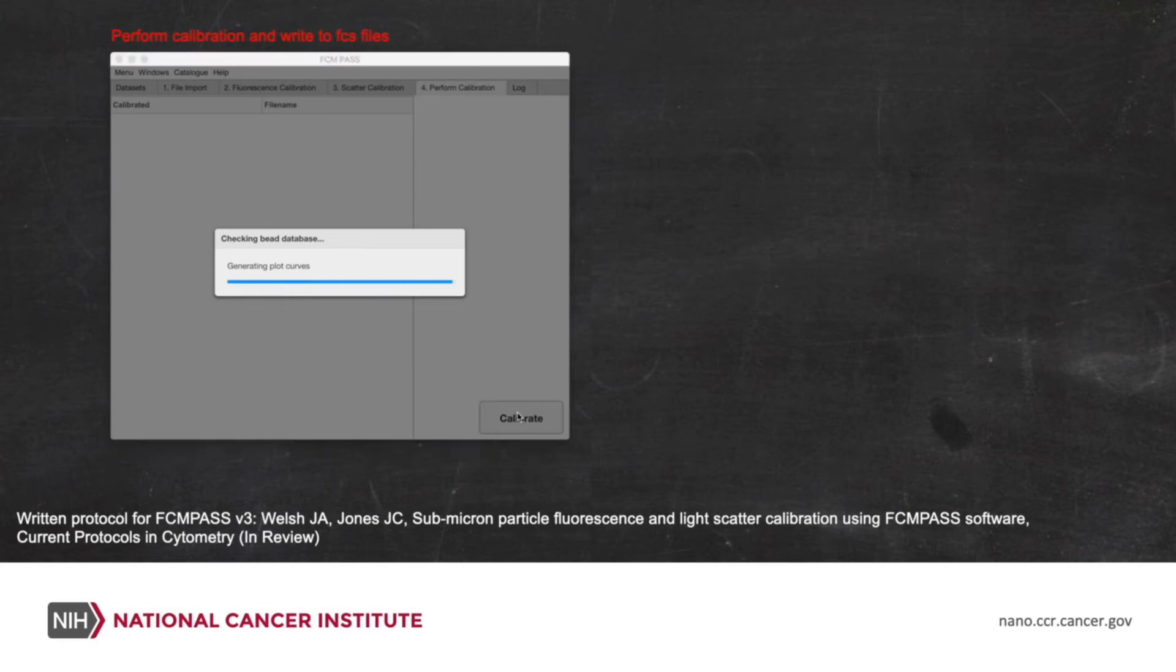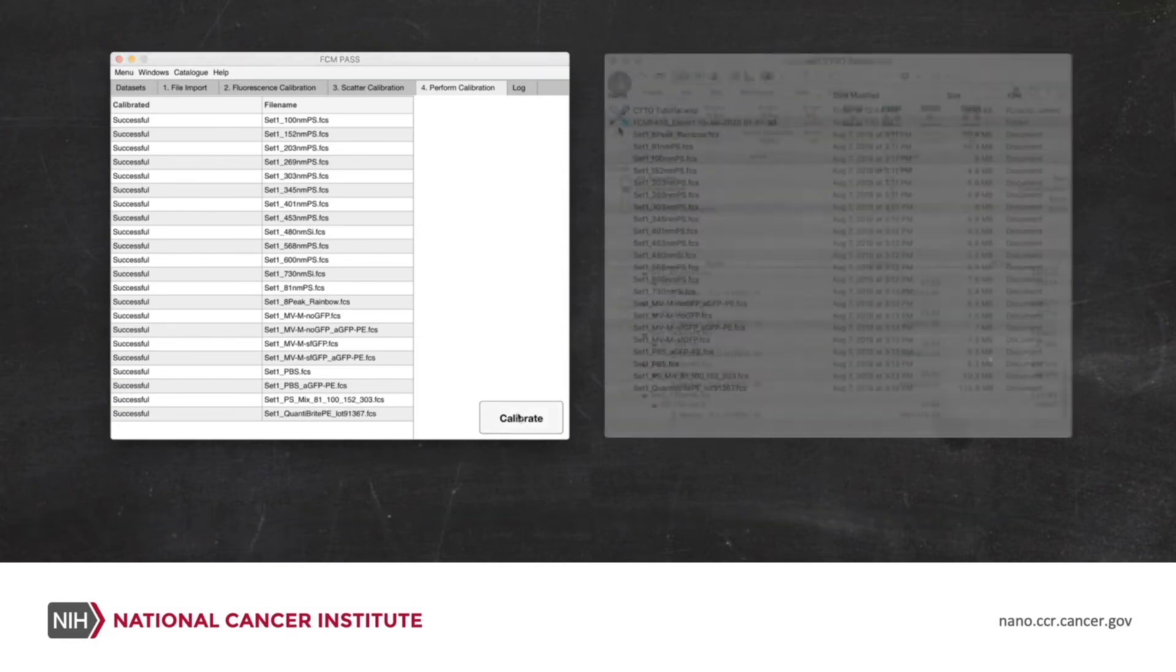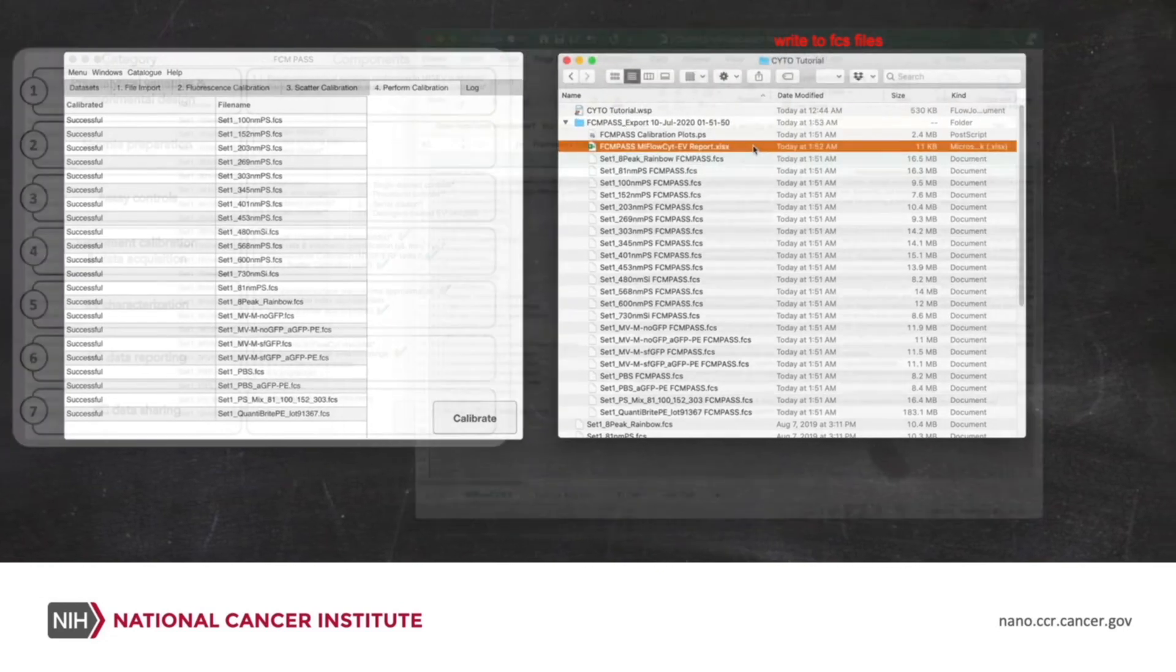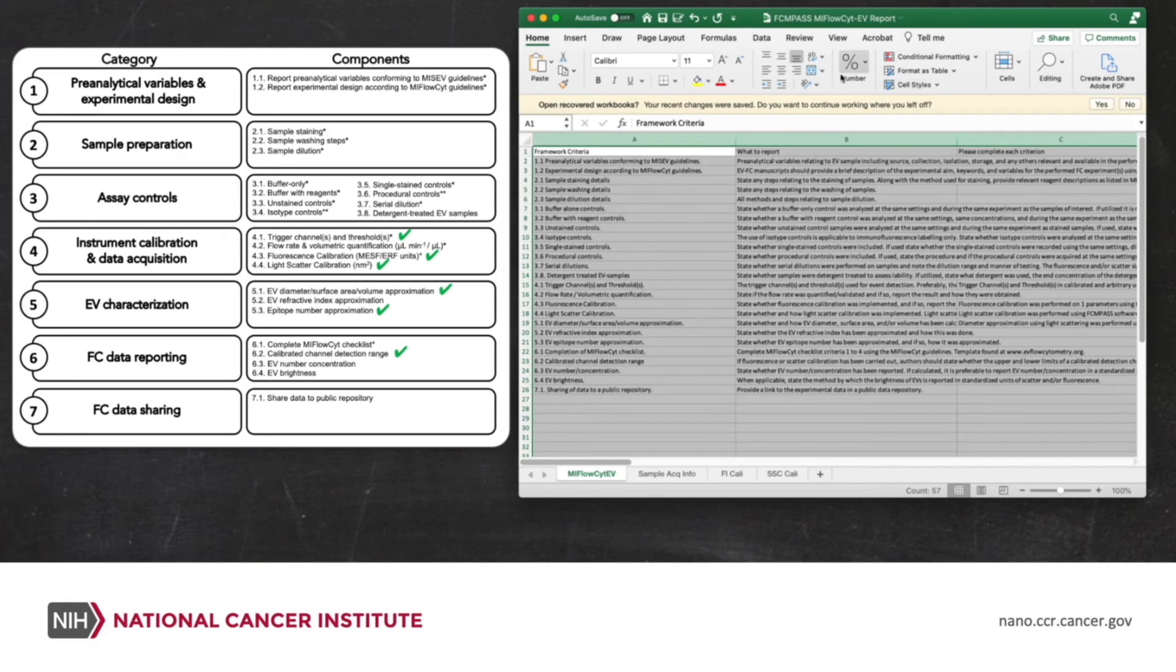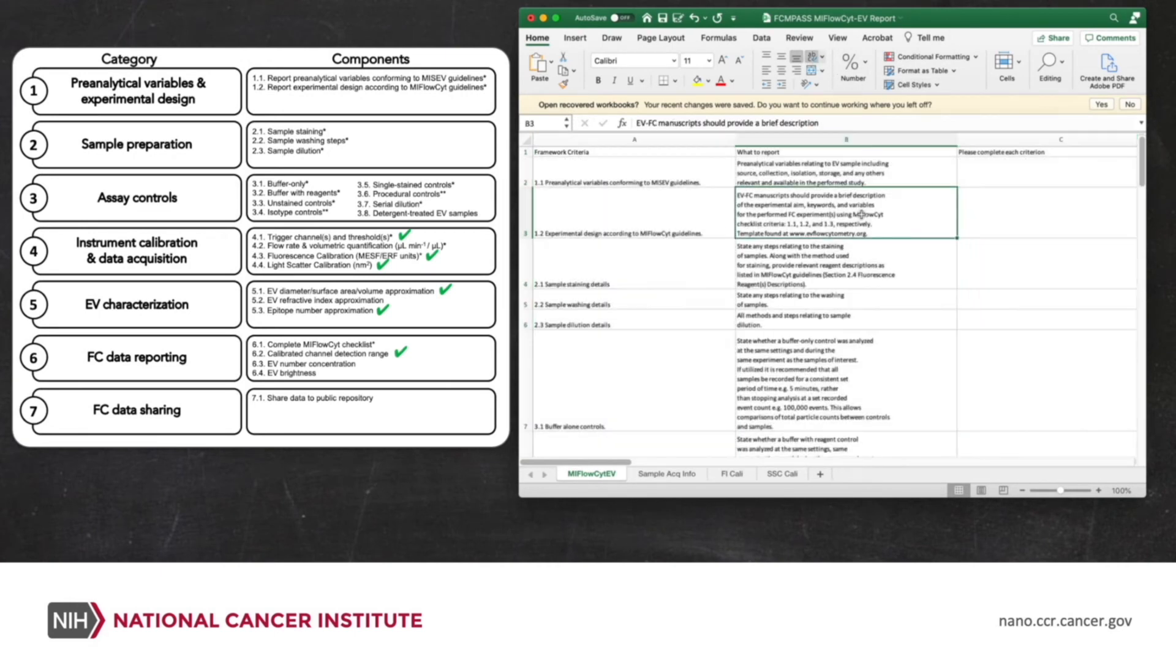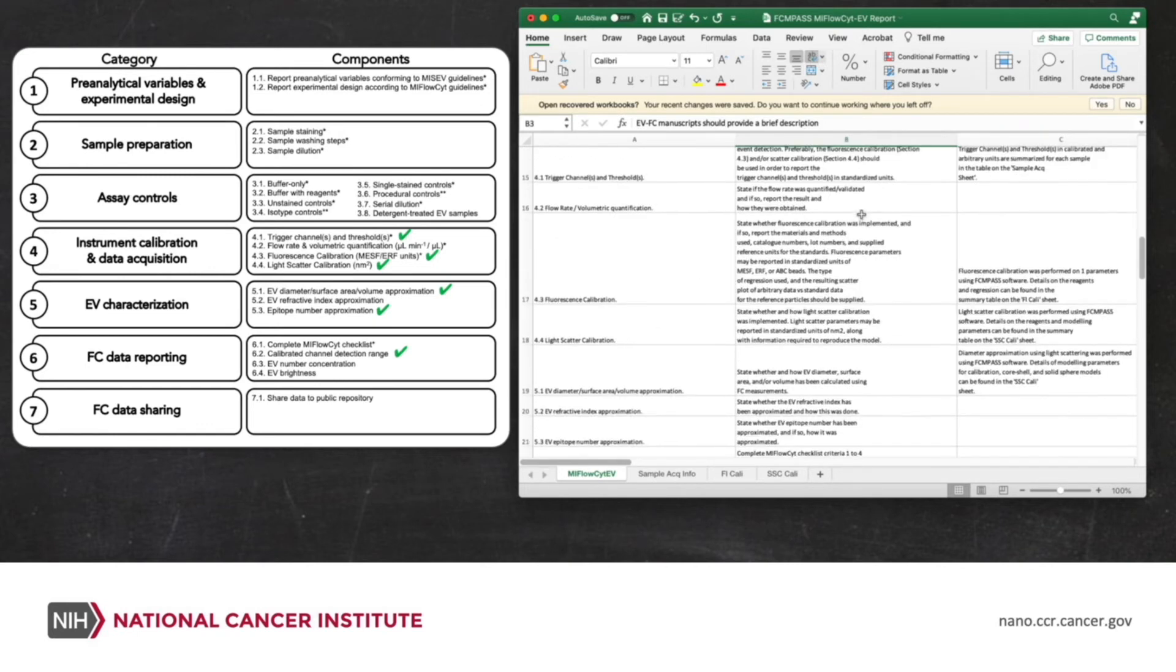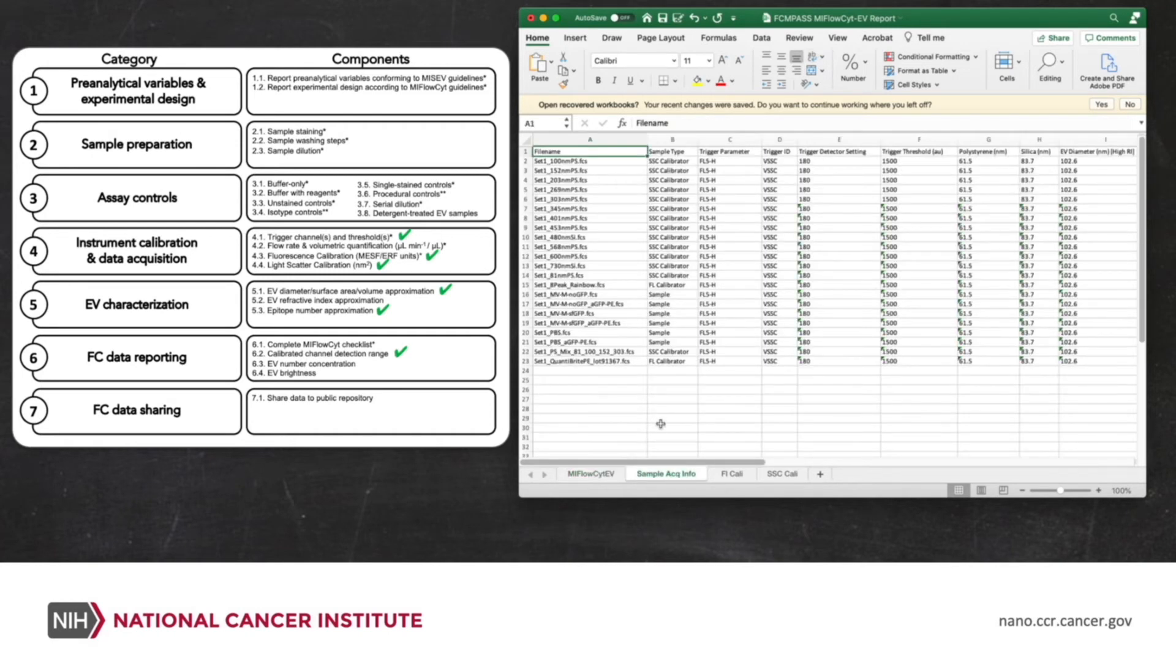When all of these files are calibrated, they'll be exported to the same folder that the files were imported from. There'll be a folder in there called FCMPASS export and the time that the files were exported, as you can see here on the right. And in there, we've got our calibrated files. We also have our MIFlowCyt-EV spreadsheet. So this has been semi-completed now for the calibration parameters. The upper parameter, the upper fields are for the metadata. All of the information that we could pull out of the FCS files and the catalog have been completed.